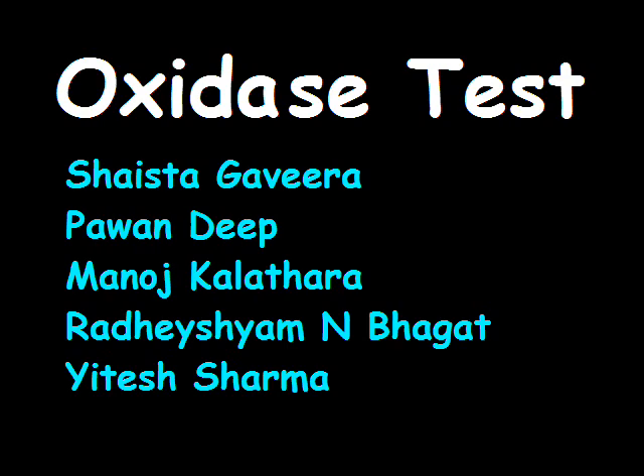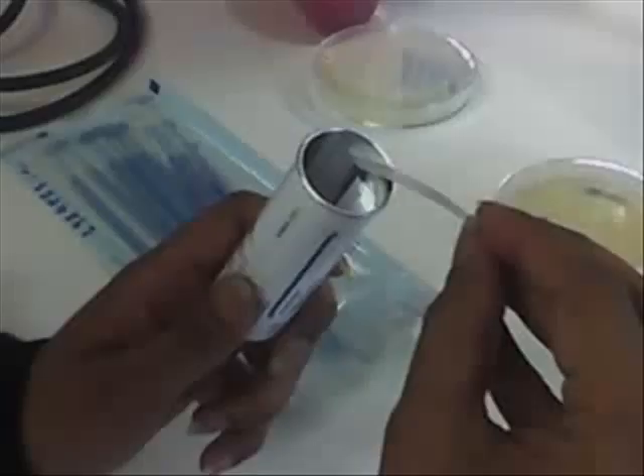Today we are demonstrating the oxidase test. Firstly we have taken two oxidase test strips. Now put the bacteria that had been grown on the petri plate over these two oxidase test strips.